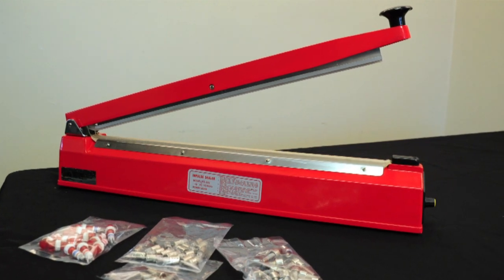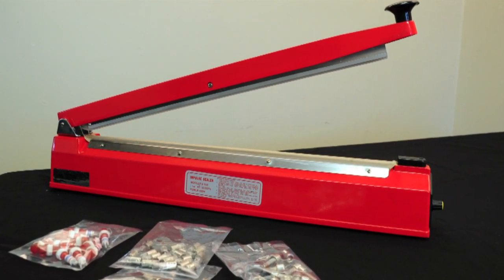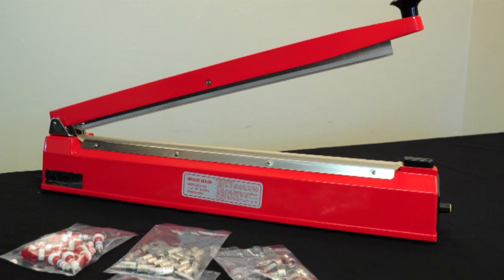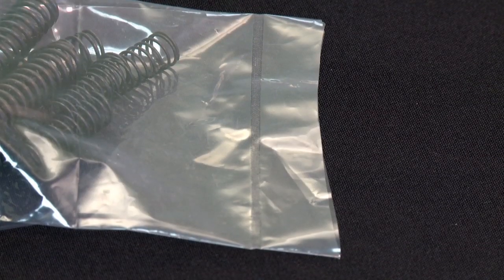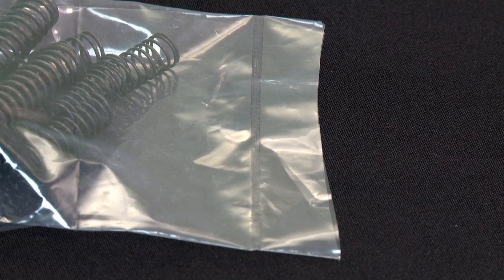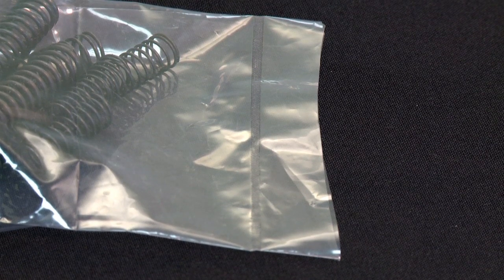Cleveland Equipment Company's line of hand operated impulse heat sealers are ideal for any application that requires a tight seal. This machine provides a water and air tight seal for effective autoclaving and sterilization procedures.